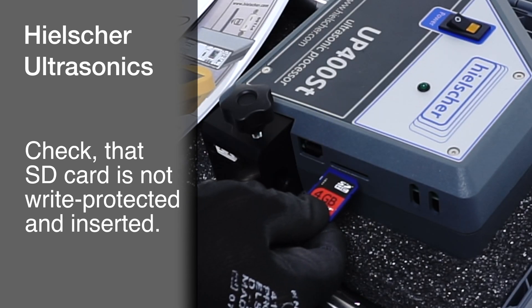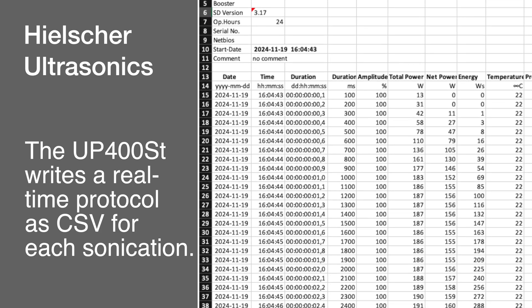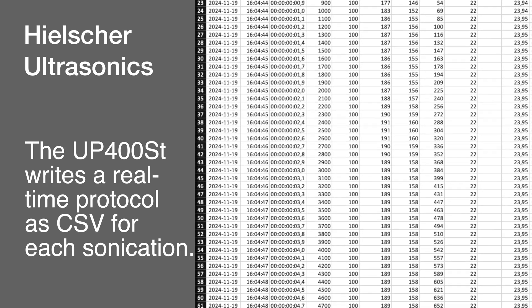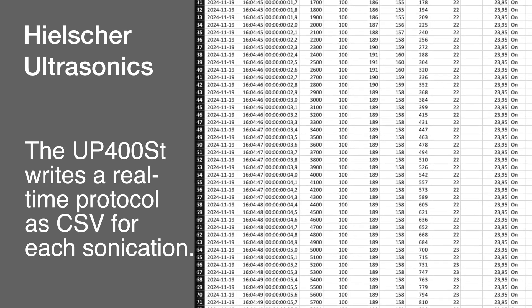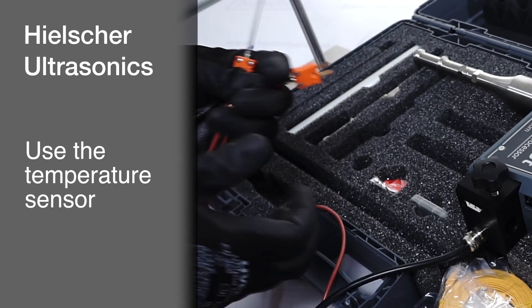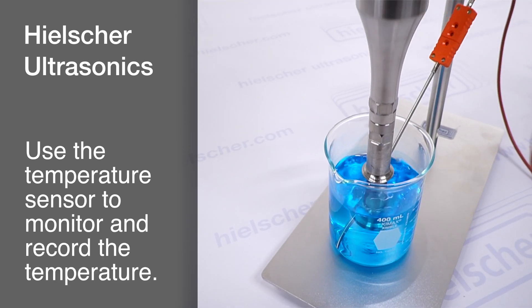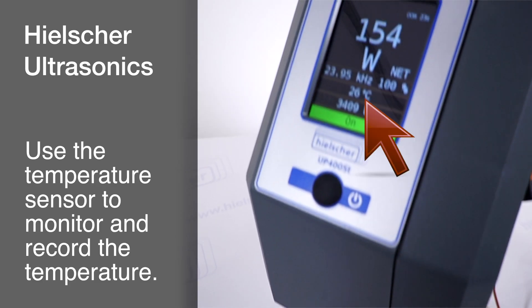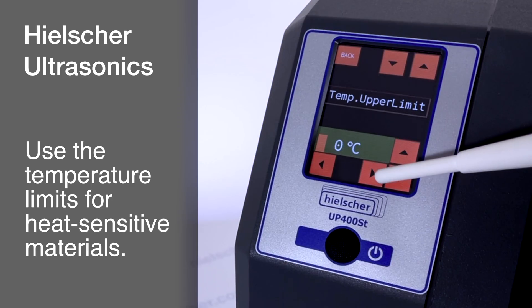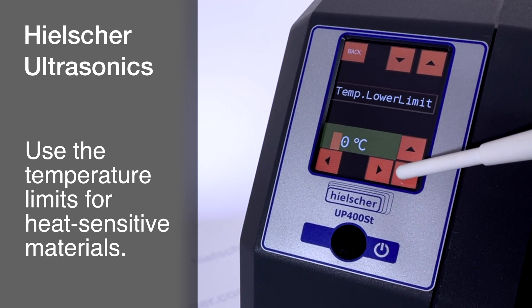Please check that the SD card is inserted into the device. With the SD card in place, an Excel-compatible protocol of all relevant sonication parameters will be automatically recorded in real-time to the SD card for your documentation. The included temperature sensor connects to the device with an extension cable. This sensor allows you to monitor the liquid temperature on the display and record it on the SD card. You can also set temperature limits at which sonication will automatically pause or stop, which is particularly useful for temperature-sensitive materials.